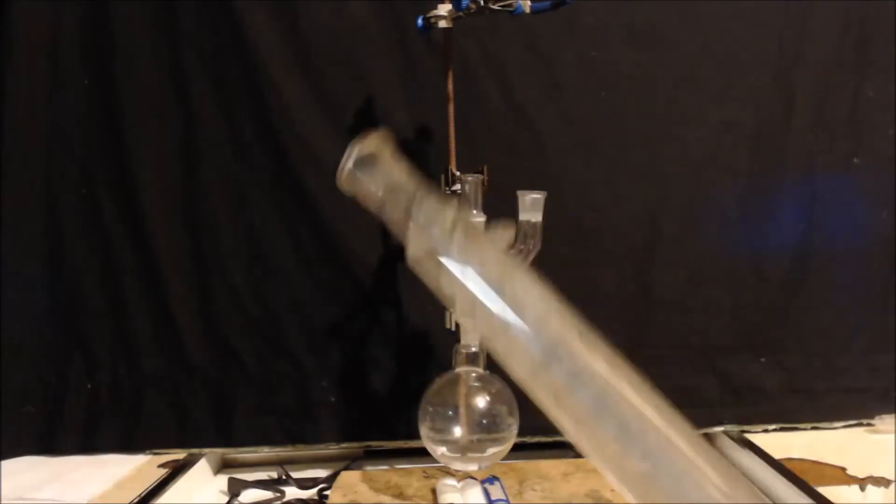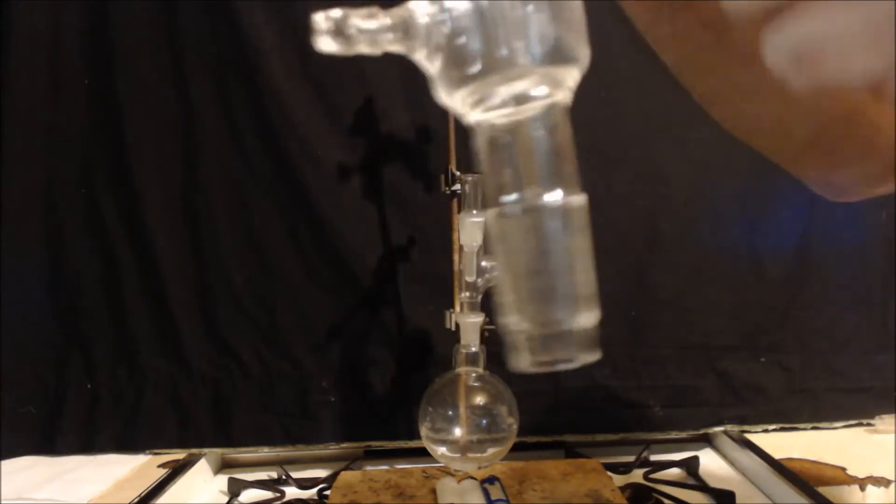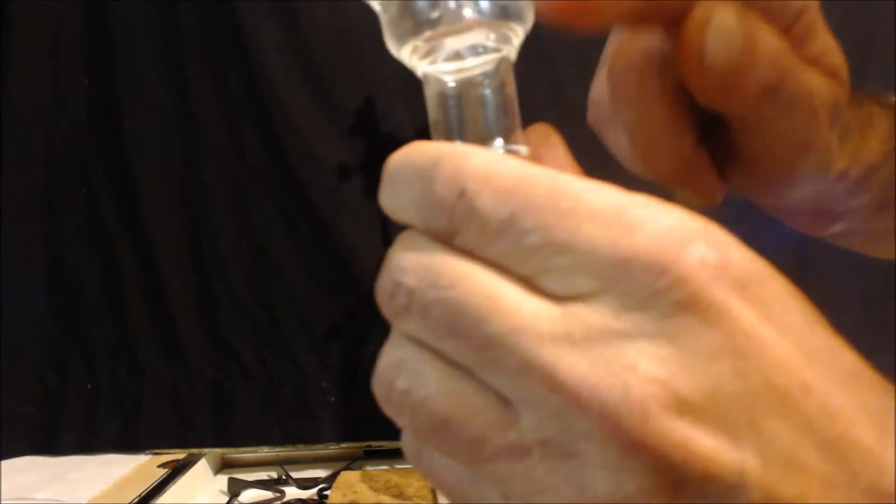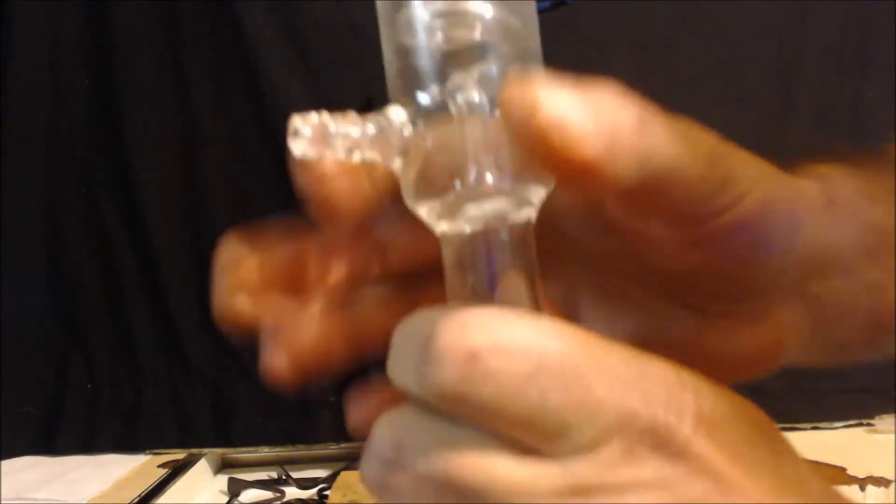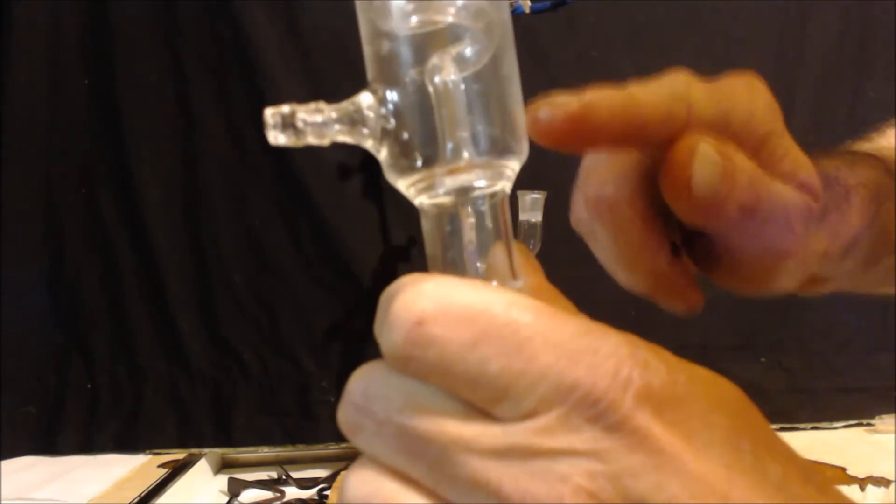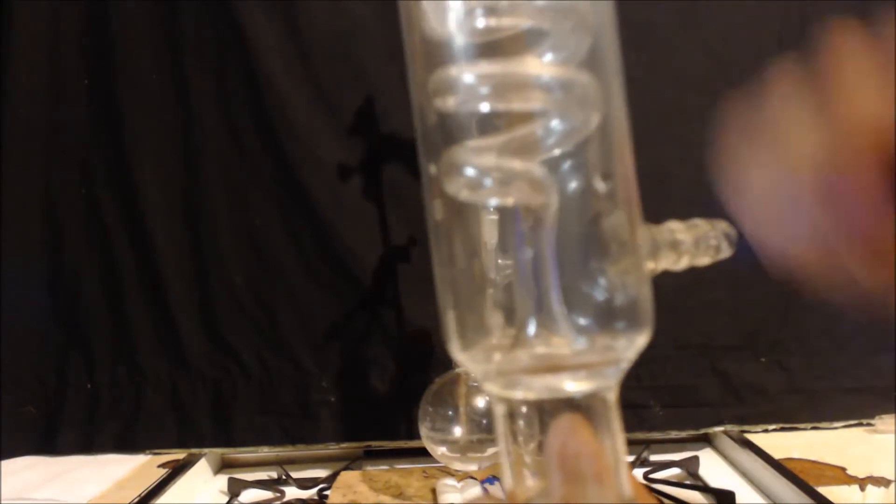Okay, I wanted to mention a couple things. This coil type condenser, the fumes go up inside this little tiny pipe, a little tiny pipe inside, it's curled. So when it comes up, I just don't want you to think that it was on the outside and trying to hit the coils. It's inside the coil. So definitely if it rises, it has to, it has no choice. You can see right here, it will come in and it has to hit the tops the entire way going up, meaning the top of the coil.